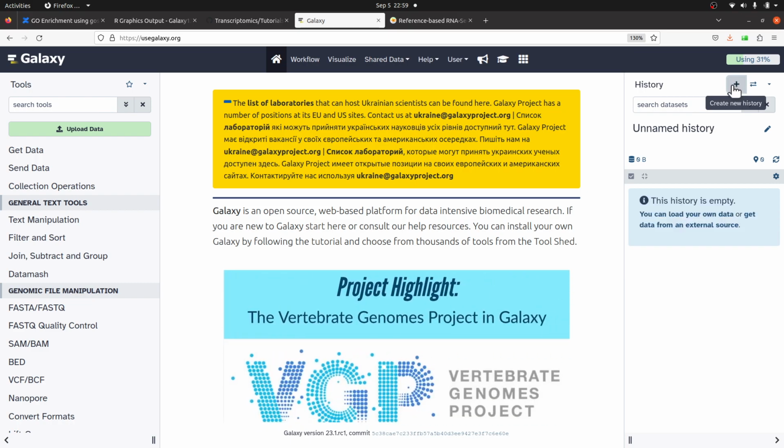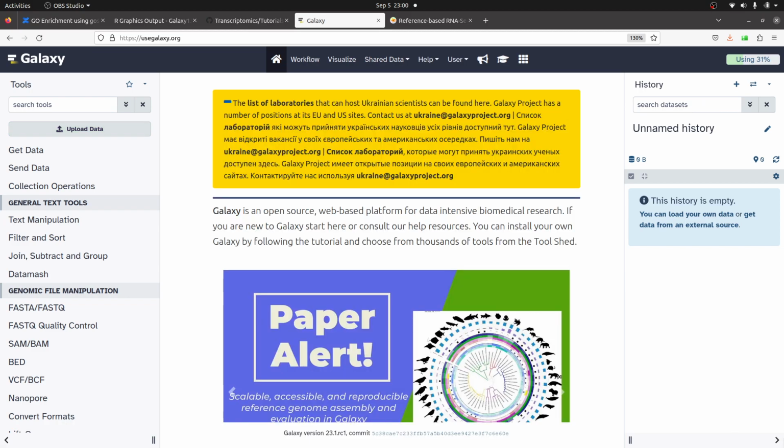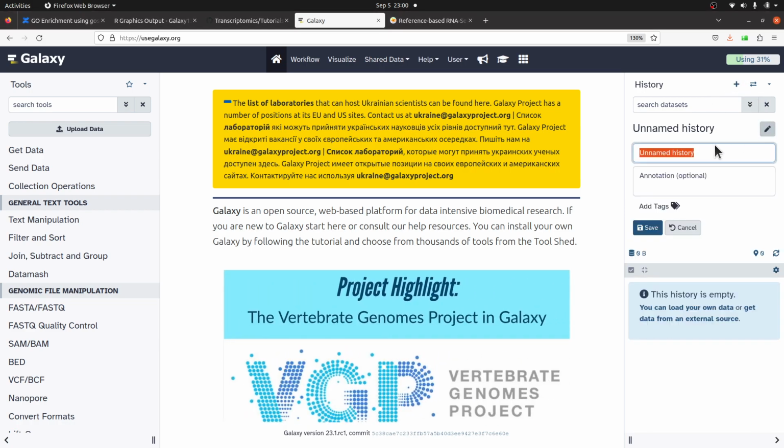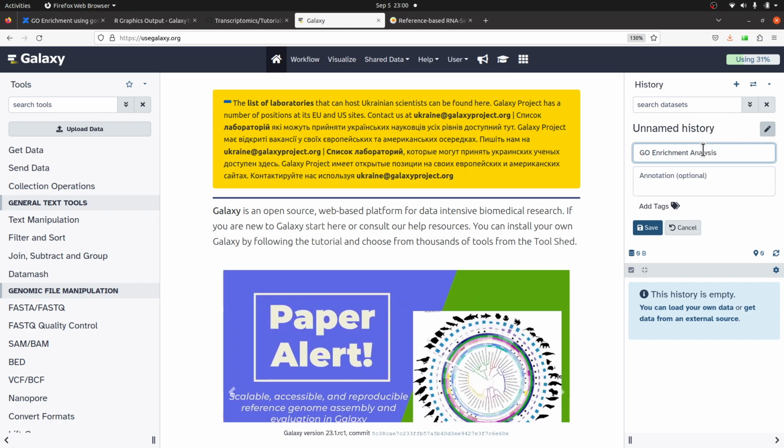Let me just redo it again. So I'll just click on this plus to create a history, and then you have this coming up. So here you can edit and rename. I'll just say GO enrichment analysis.